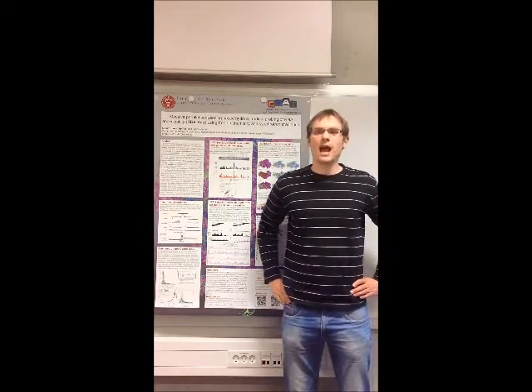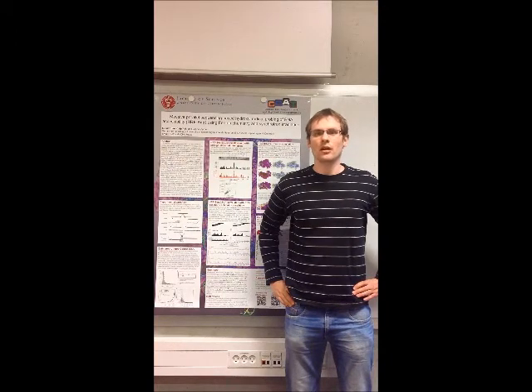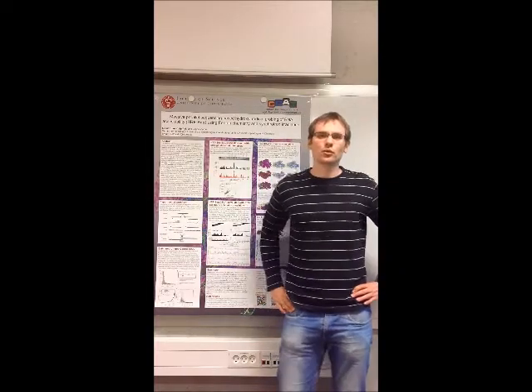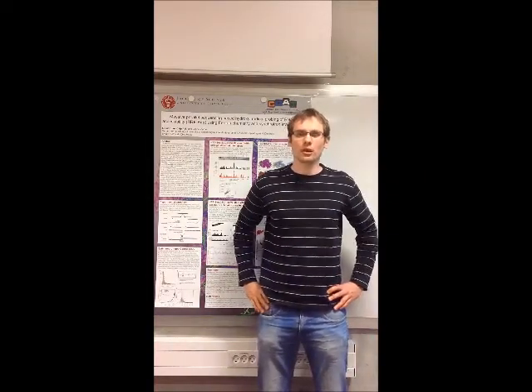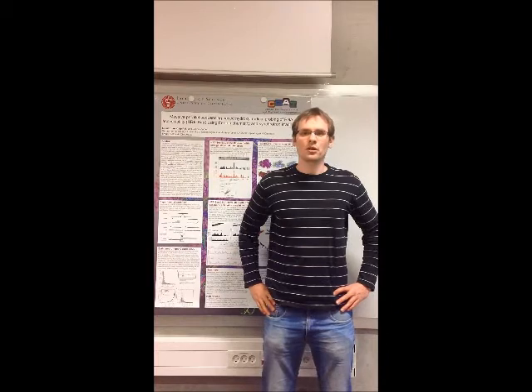My name is Lucas. I would like to present the HRF-Seq method, which is a method for assaying RNA backbone accessibility with hydroxyl radical detected with next-generation sequencing. Hydroxyl radical footprinting is a well-established method for RNA tertiary structure probing. It was used for studying RNA dynamics or for 3D structure modeling.